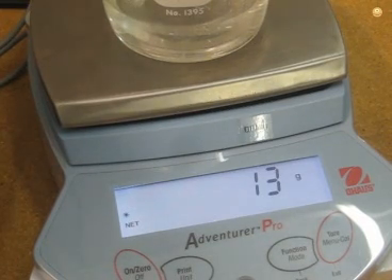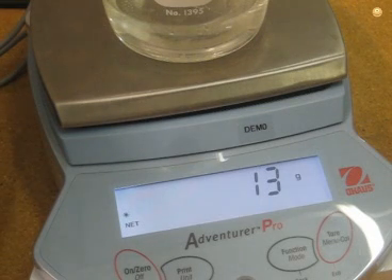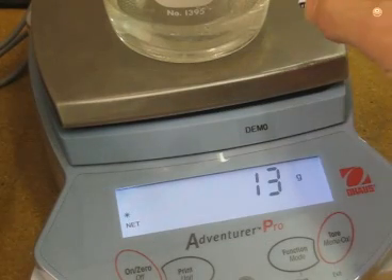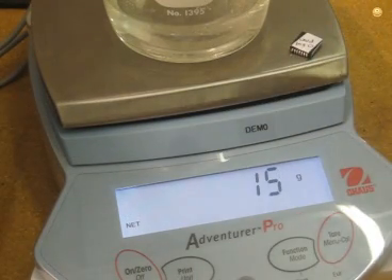The last thing I need to show you is that when the scale reaches 15 grams, which would represent a 2x concentration, the PureTech will automatically stop. It's got 13 grams, and just for the video I'm going to gently increase it until it hits 15 — and it should stop. And there you have it. Stopped at 15.